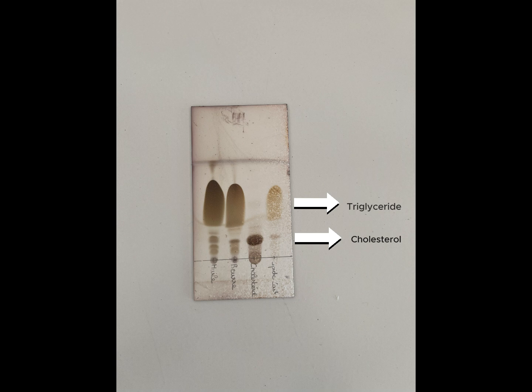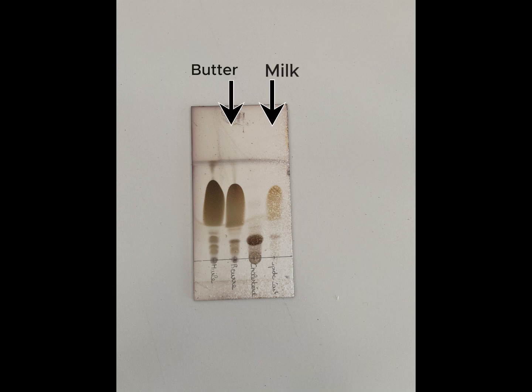These compounds migrate differently depending on their polarity and interaction with the solvent. By comparing the migration patterns, we observed that the lipid composition of butter is most similar to that of milk.